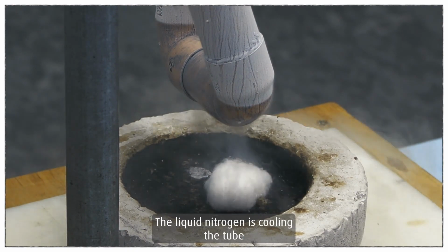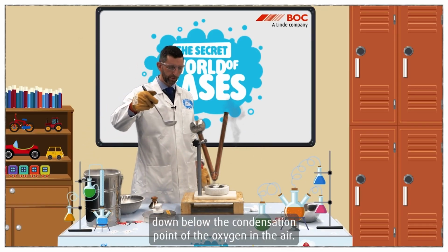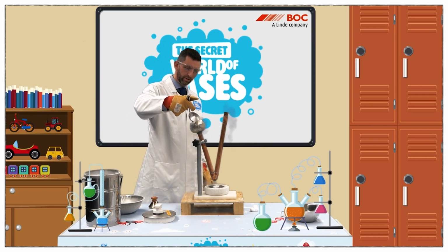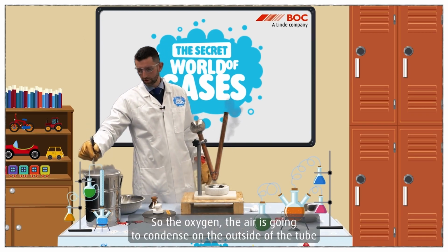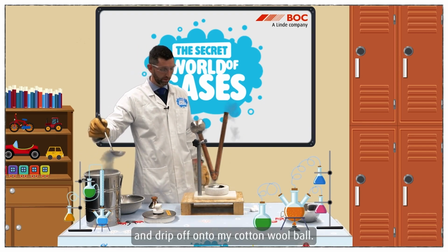So the liquid nitrogen is cooling the copper tube down below the condensation point of the oxygen in the air. So the oxygen in the air is going to condense on the outside of the copper tube and drip off onto my cotton wool.